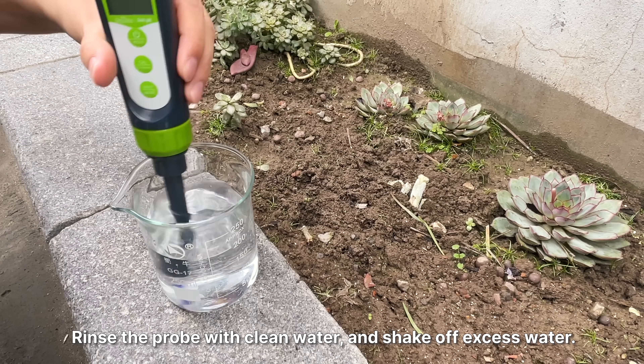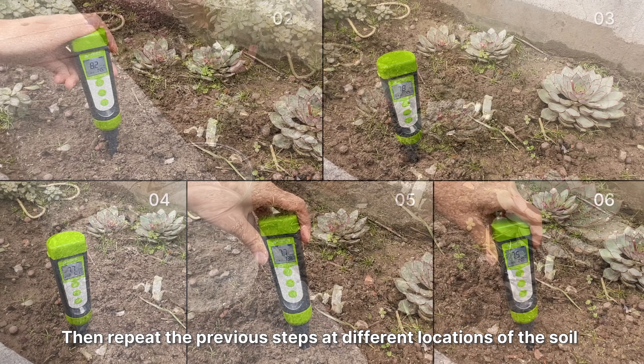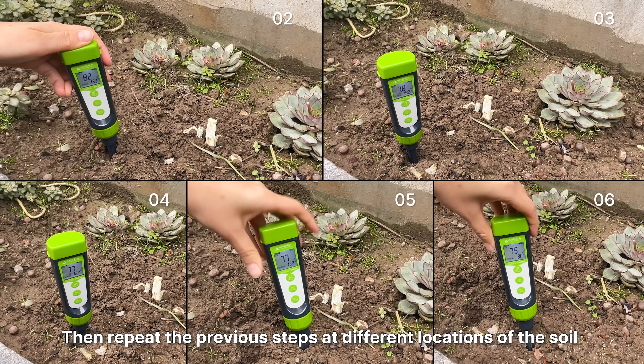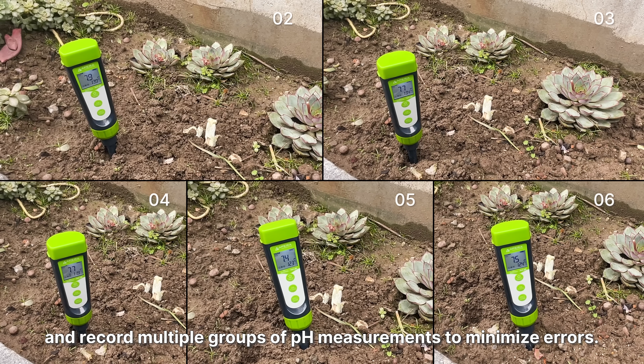Rinse the probe with pure water and shake off excess water. Then repeat the previous steps at different locations of the soil and record multiple groups of pH measurements to minimize errors.